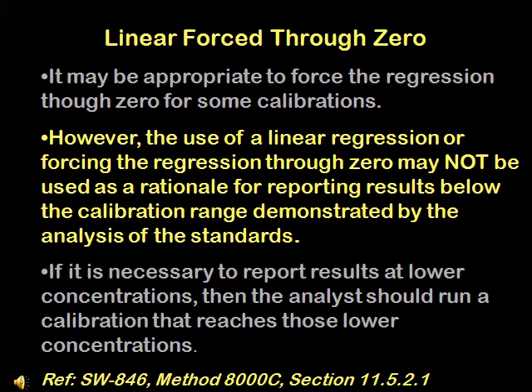This model does not allow reporting below the calibration range. The lowest standard is used to denote the reporting limit. If it is necessary to report results at lower concentrations, then the analyst should run a calibration that reaches those lower concentrations.